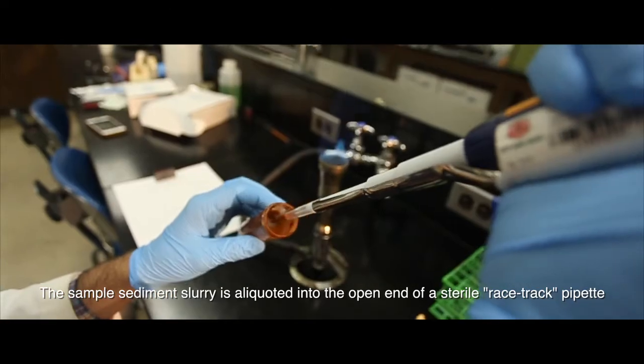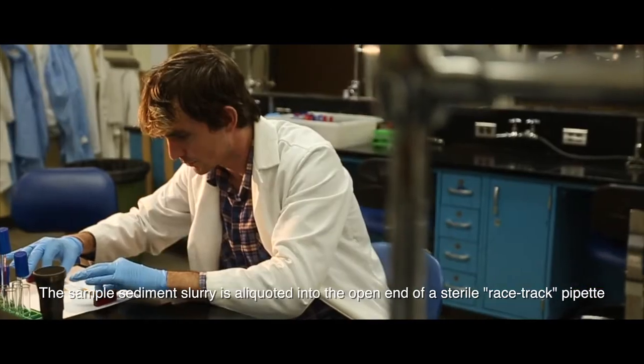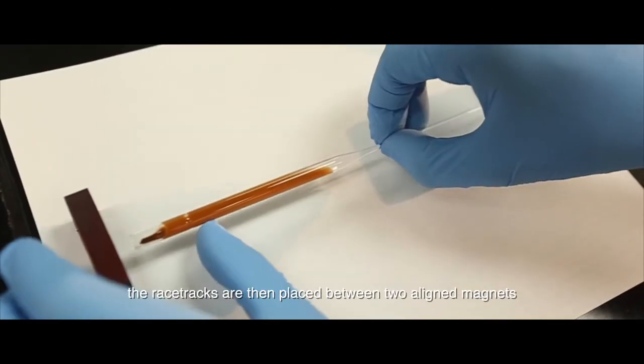The sample sediment slurry is aliquoted into the open end of the sterile racetrack pipette. The racetracks are then placed between two aligned magnets.